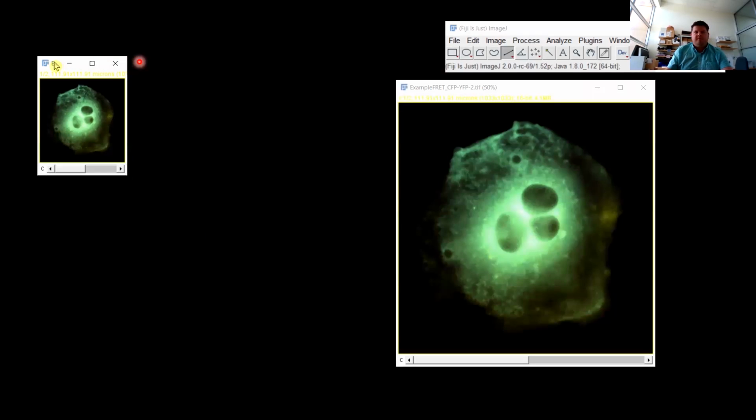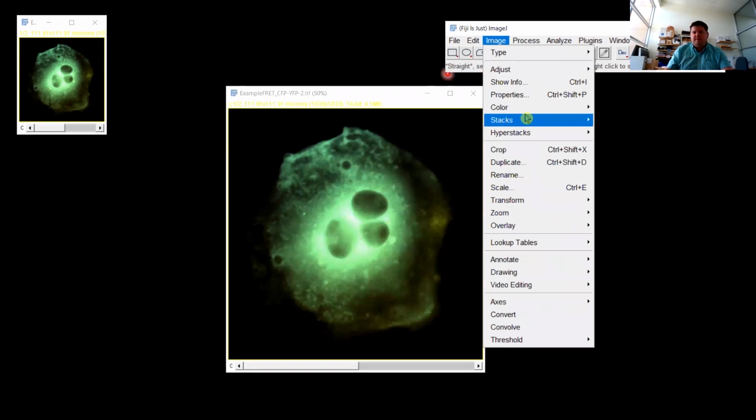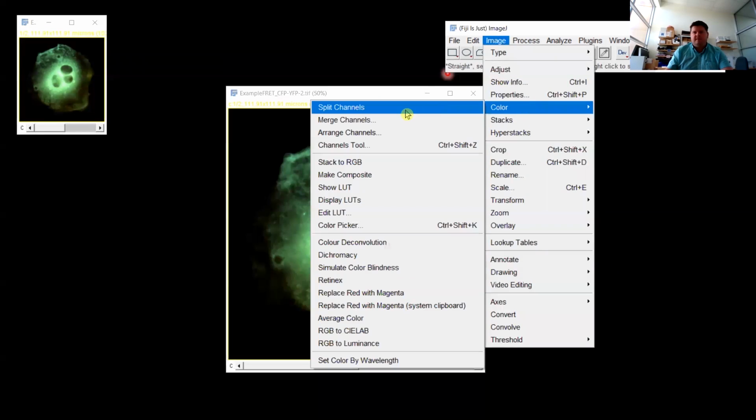I'm just going to move an original copy and work on an extra one. So I could straight away split the channels.